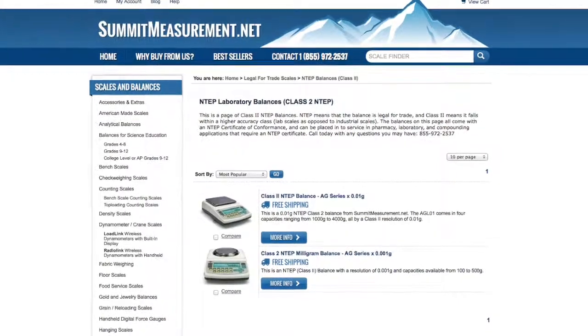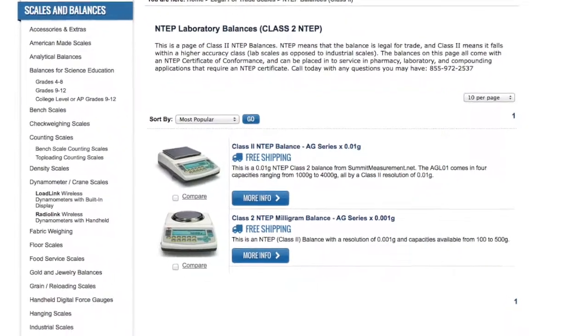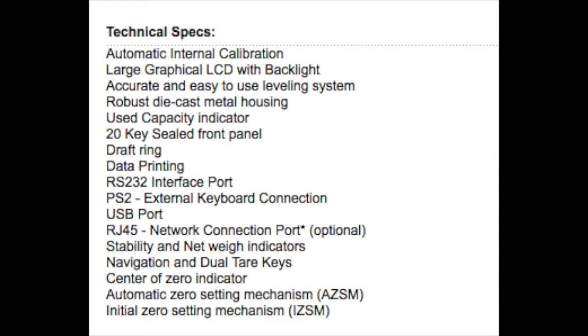The AGL series comes in several capacities and two available resolutions, 0.01 and 0.001, also referred to as a milligram. The AGL series is manufactured in Europe and comes with all the features you would expect from a premium quality Intep balance, including a 24-month manufacturer's warranty.